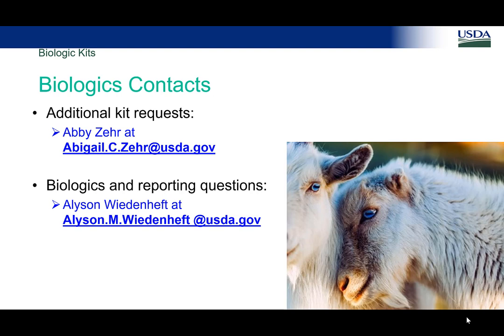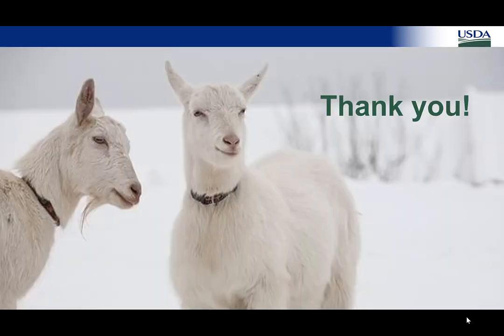I just want to make a note with FedEx. It's always good, the day you're going to ship, to check the weather in Memphis, because things will get lost in the abyss in Memphis if they're having weather problems and they put everything in a warehouse. So it might be a good idea to check that before you ship samples. I also think it's better than it used to be, but just don't tell FedEx what's in it. When you put that UN 3373 sticker on there, the clerk gets lost about what it is, so we don't write blood on there.